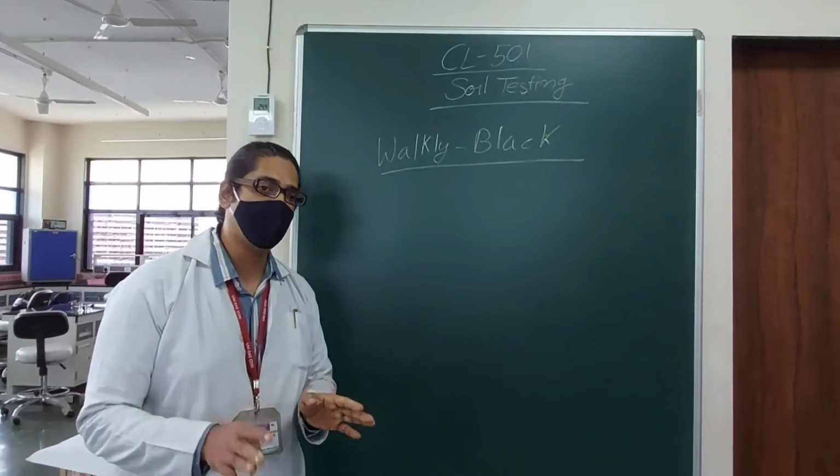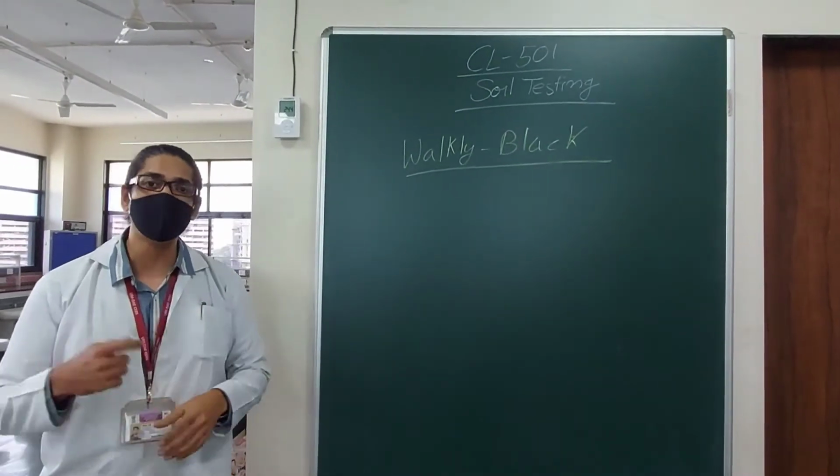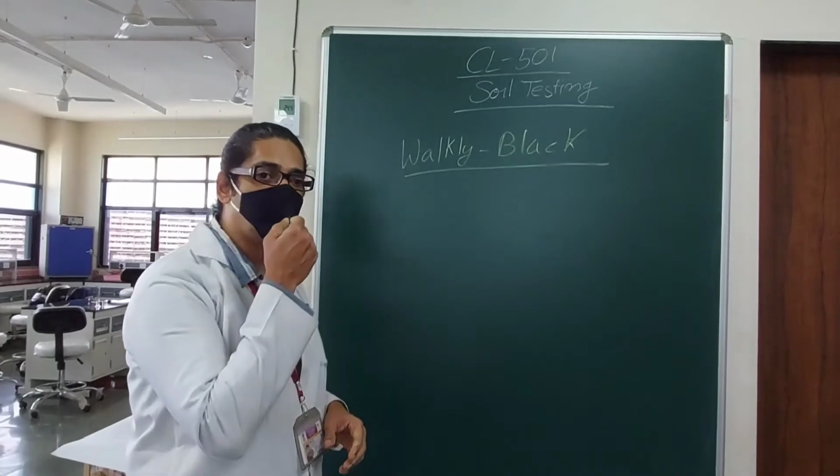Very simple experiment. These are some of the experiments which you have already done. Remember, we are going to apply all of that knowledge, what we know.